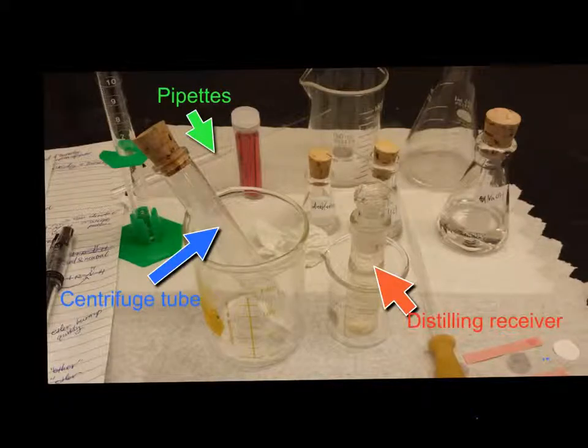Okay, next slide. I'm going to talk about the materials I used in the lab. In these pictures, I used a distilling receiver, where I dissolved my unknown mixture with diethyl ether. The extracted acid and base aqueous layers were deposited into two of these centrifuge tubes with clean pipettes, the pipettes in the back.